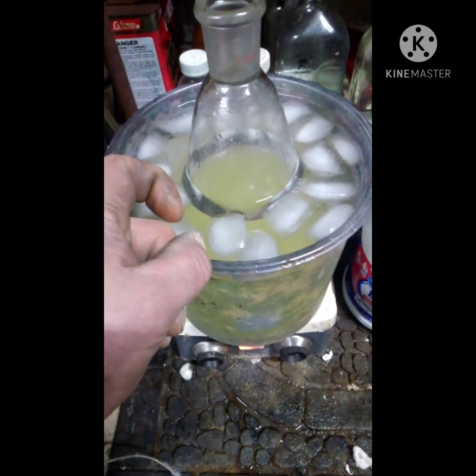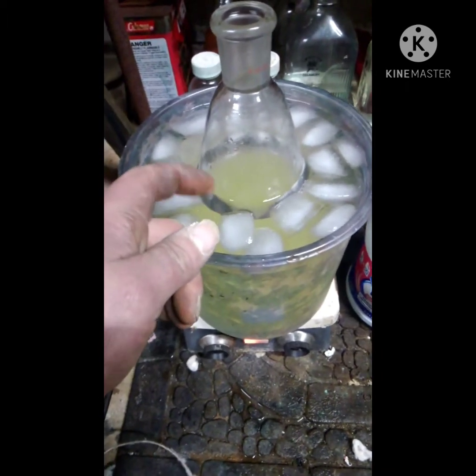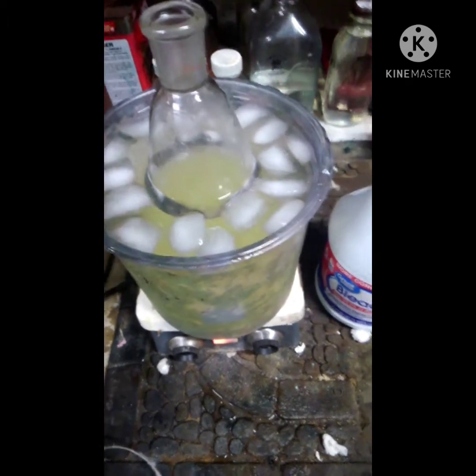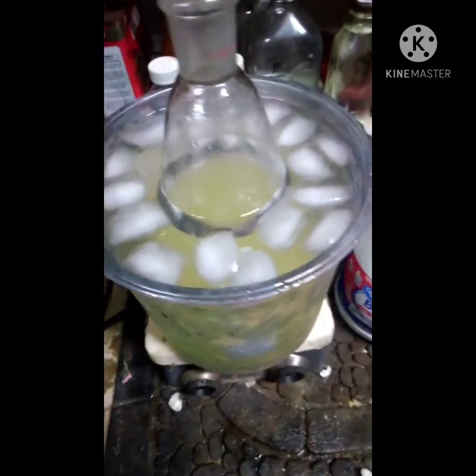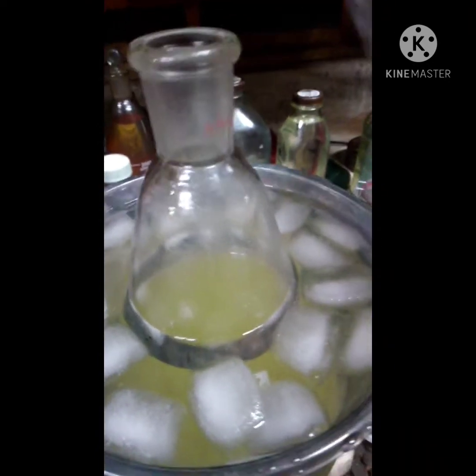After I put the 75 milliliters in, if it doesn't clear up within a couple of minutes I'm going to slowly start adding more in little increments. Actually, I should probably put in 50 milliliters first and then start adding smaller increments. I've got 75 measured out here so I'll just use 50 of it.